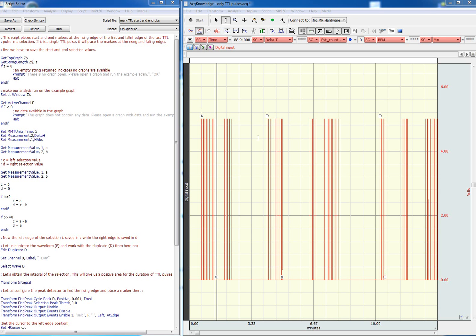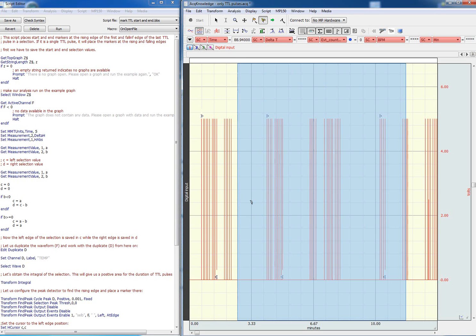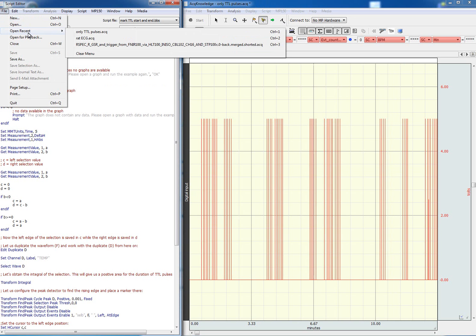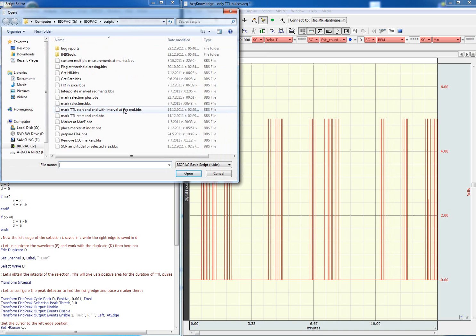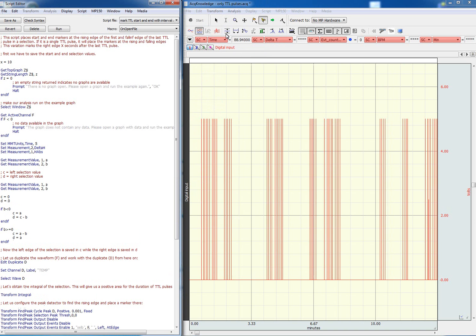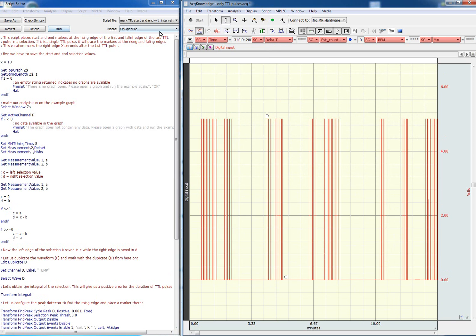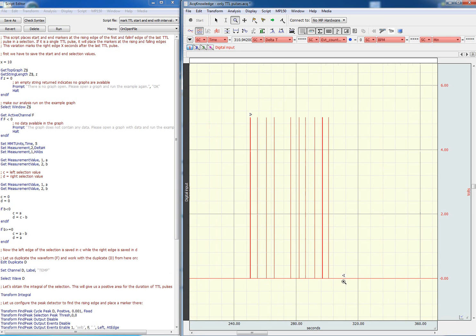Let's go ahead and demonstrate it as well. First we go ahead and delete the markers and load up the other script. Now we just select an interval again, hit run, and if we zoom in we'll see that the end marker is placed a few seconds after the last TTL signal.